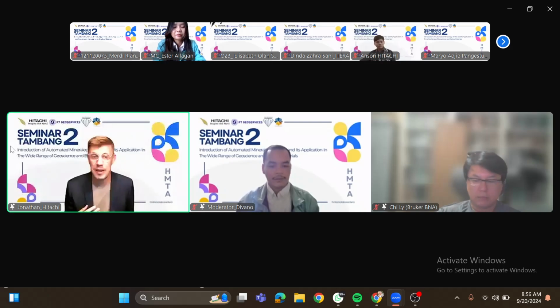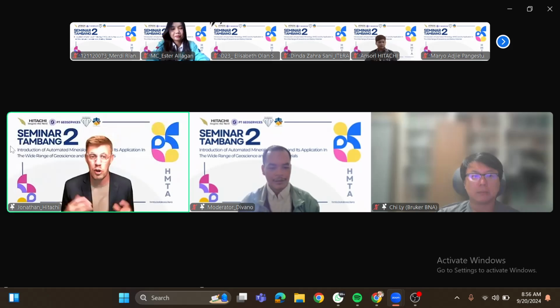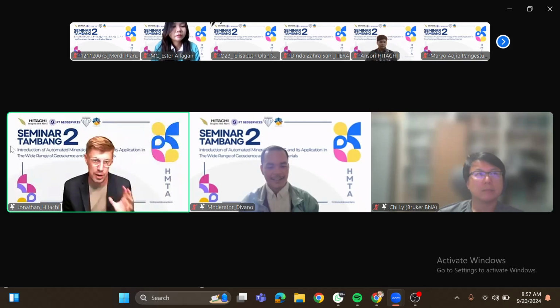And what we care about is not necessarily the minerals, but we care about the rock, the lithology. And lithology is a collection of minerals, but not always the same and in different proportions. So you have to look at the proportions and those sorts of things. But what we can do with AMICS is we can sort those particles and we can export the images all in the same way and collect it all in the same way so that they can be used for training of machine learning models.